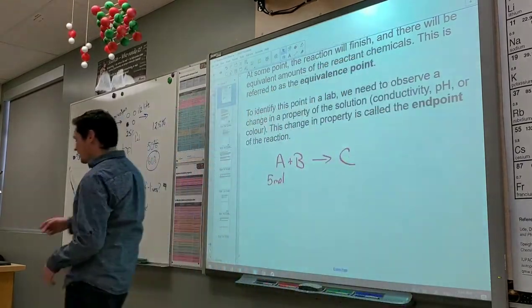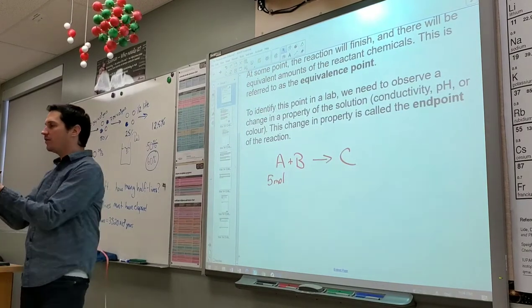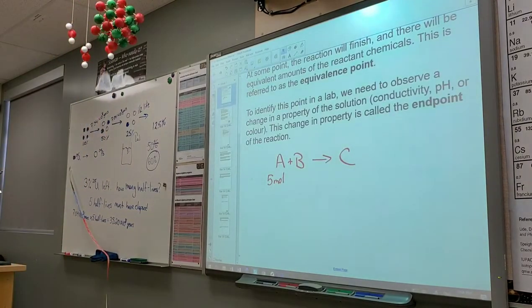So what's going to happen is you're going to have a little bit of liquid in here. By the way, I want to be very clear: I should be using an Erlenmeyer flask. What's the difference between a beaker and an Erlenmeyer flask? One's bigger. No, not one's bigger. What was that, Stephanie? Accuracy. Precision. There we are. Precise.